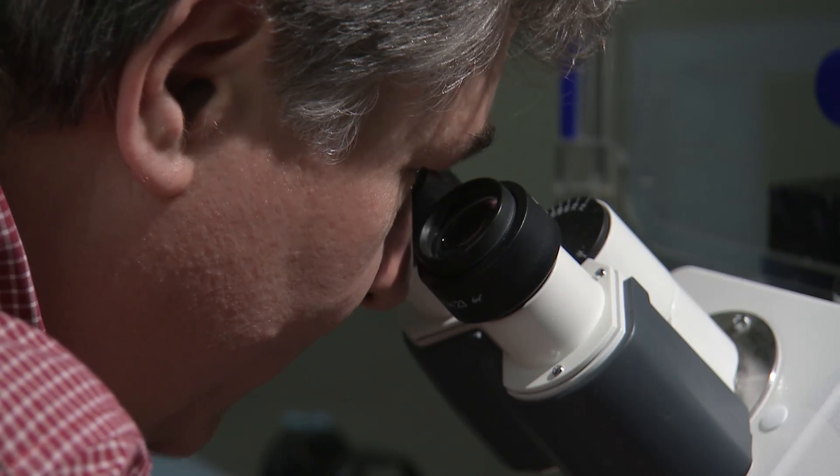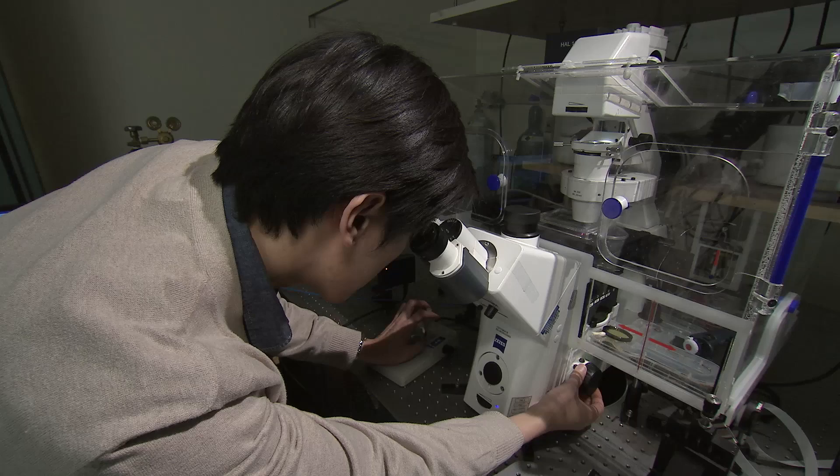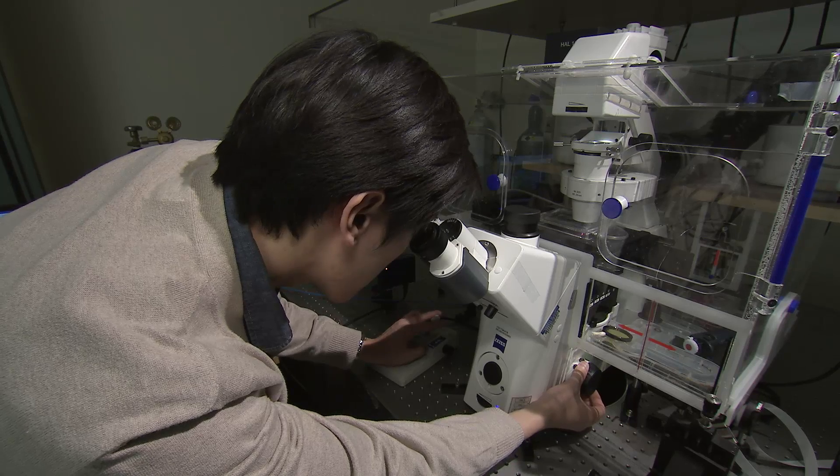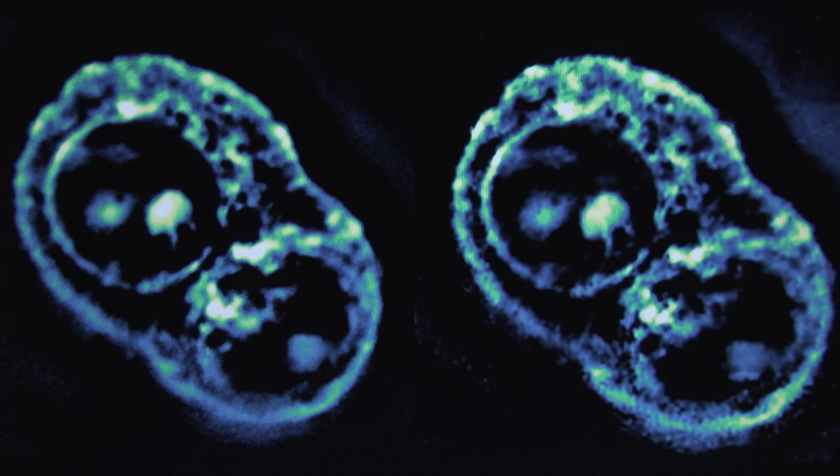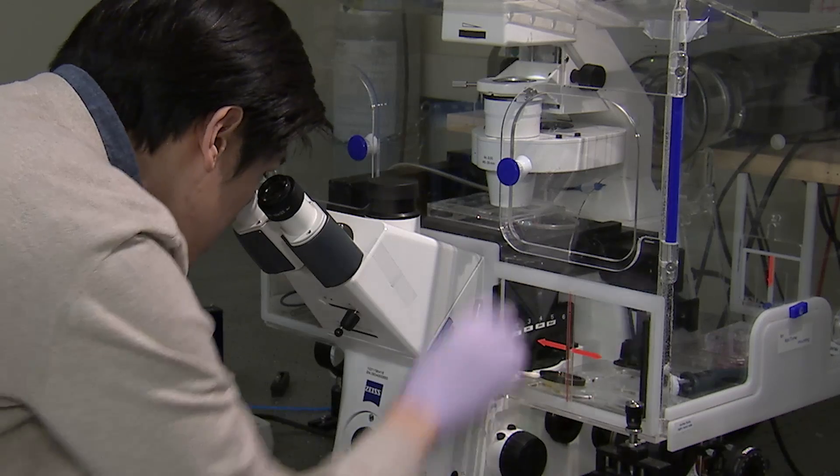But for scientists, it's not always so easy. The main obstacle in imaging living cells is that they're very transparent. Meaning they're mostly clear or see-through, so a dye is added to color the cells to make them visible. But dyes can affect a cell's function or kill them.